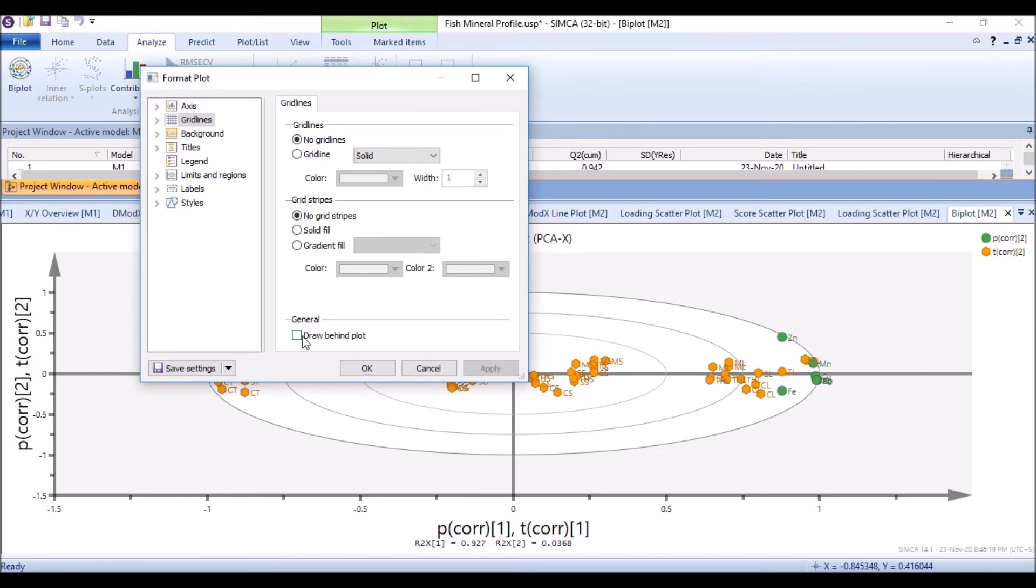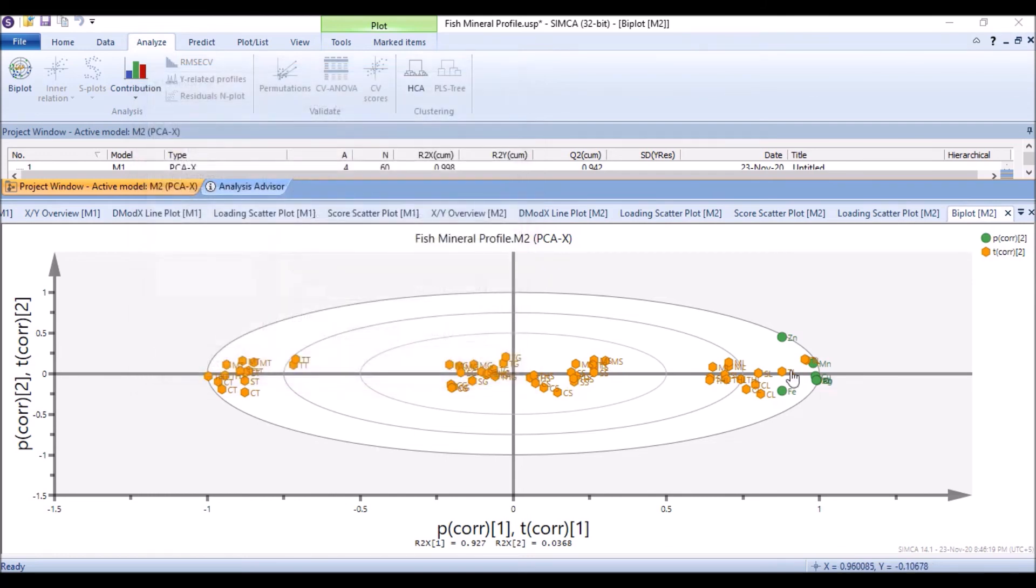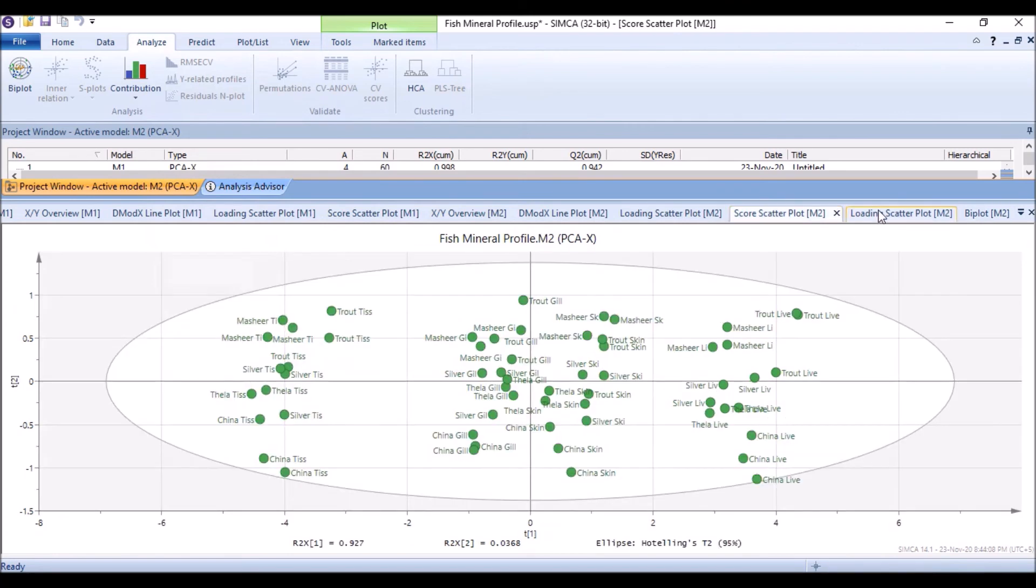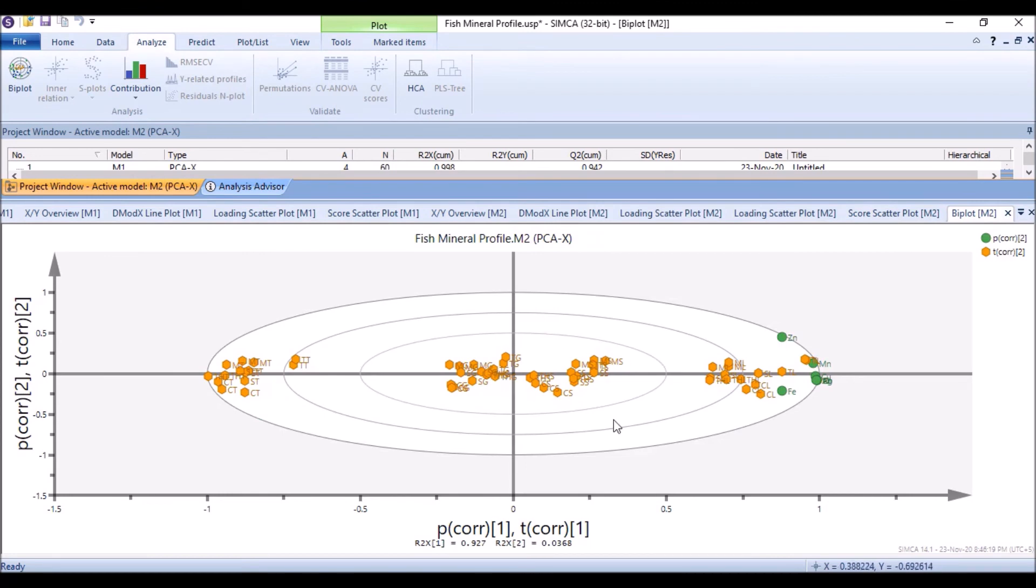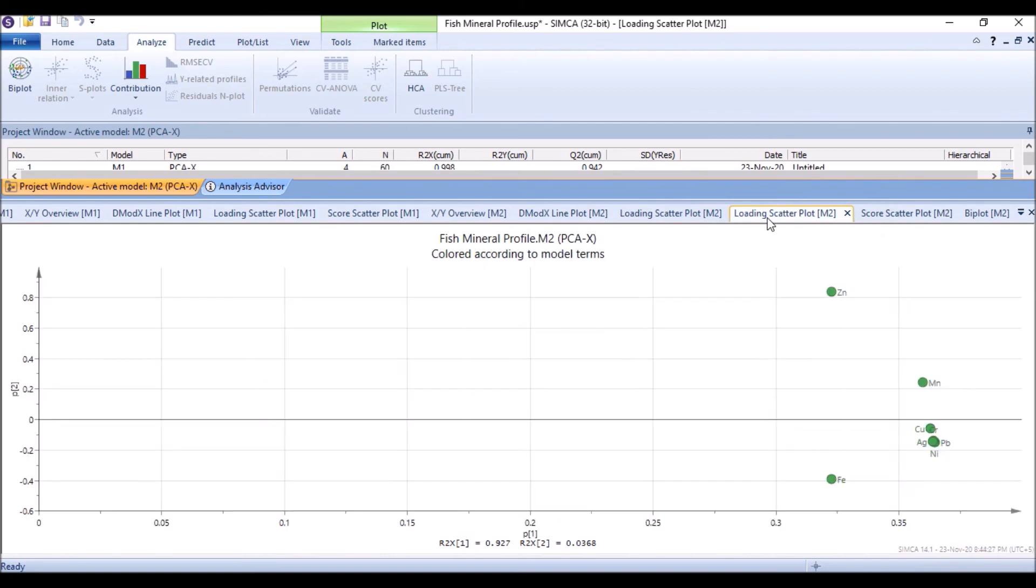Number of things we can do: label styles, marking style, or label symbol style, we can change everything as our likeness. But I like this, my plot always, because instead of moving again back loading and scatter and loading scatter, it's very beautiful and nice looking. Sometimes you have huge data set and then this plot becomes a mess, and you cannot identify things in PCA. Then we need to go for the LSDA. But if your desire is PCA still, then it would be better sometimes to do a loading plot separately and score plot separately.